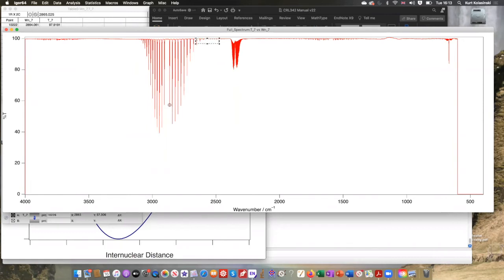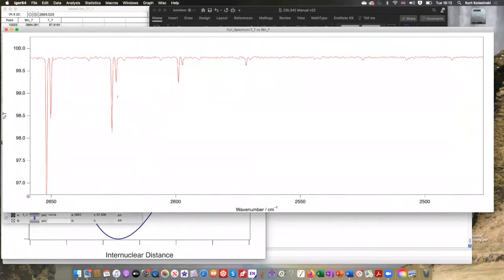Well, if we had had more pressure or even went longer in time, you'd pick up more, because the signal to noise is pretty low down here, right? There's the big peak, the big peak, the big peak. Probably that's the next one, but we're worried about it, okay? Definitely these three, no problem whatsoever. We would have had to go to even more pressure and maybe even longer averaging.